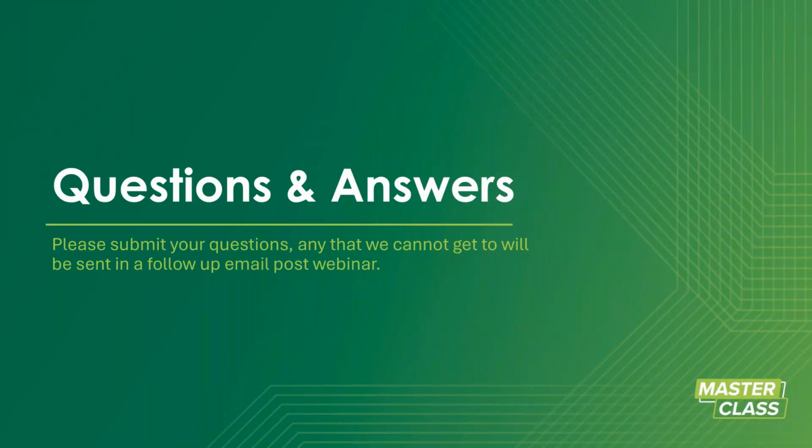Alrighty, next question. What do you do about fluctuating temperatures from seasonal weather on plumbed eyewash stations and the requirement for tepid water to be 60 to 100 degrees Fahrenheit? Yeah, that's a great question. So from a temperature standpoint, you obviously have hot and cold seasons. Some of you have more hot and some of you have more cold. What I mentioned earlier is testing during those more extreme months.